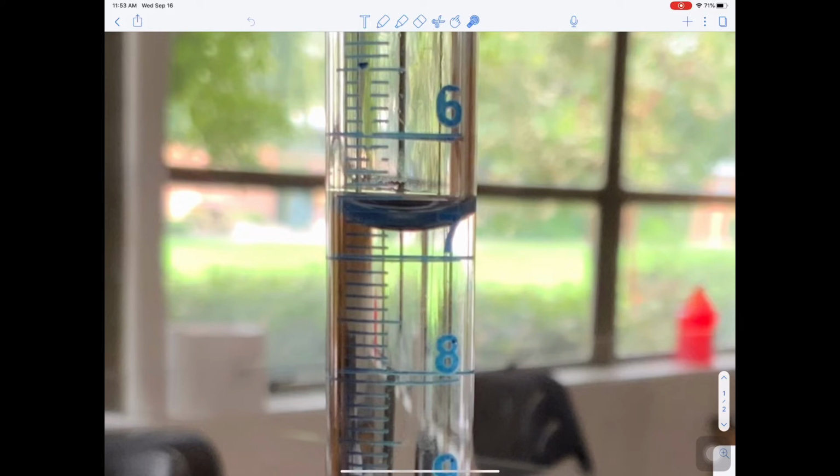And so it's very important to understand that this 6 does not mean that the burette has 6 milliliters in it. The 8 does not mean that it has 8 milliliters if the level is down there. Think of this as a ruler, that we're using to measure.